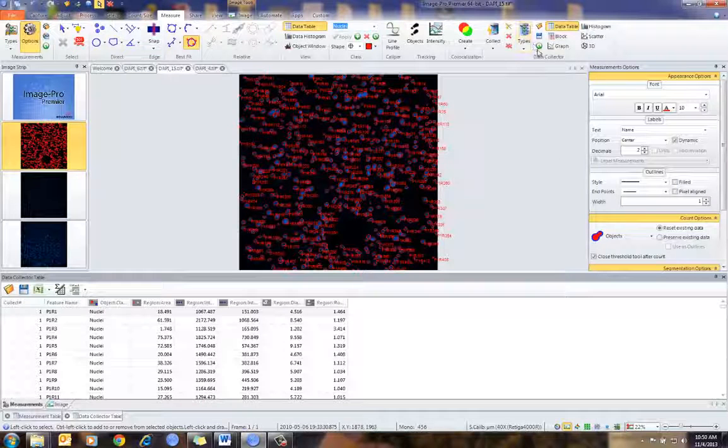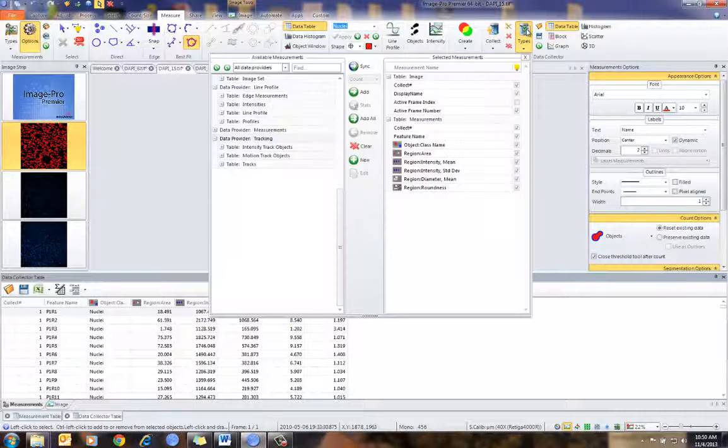But the important thing is when I press this Reset button and press Count, what that does is automatically go out to count size and bring in those measurements. So it's already set up for you. Again, I can add or change this information. I can choose what information to show or not show by simply turning off these checkboxes.